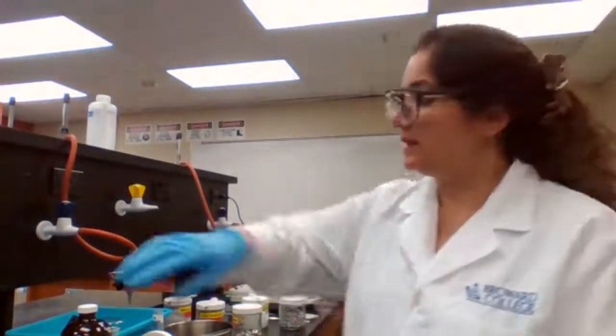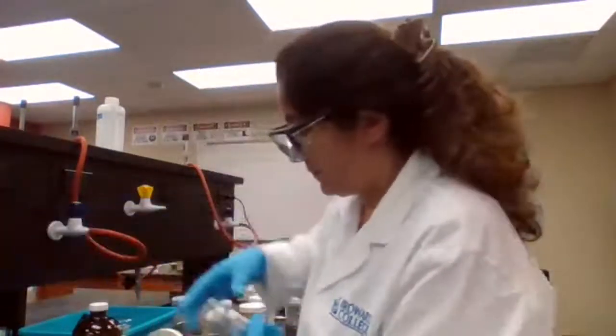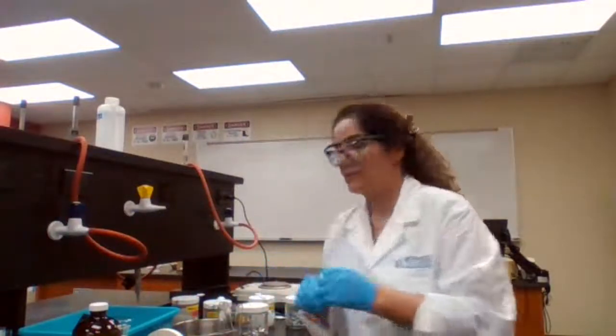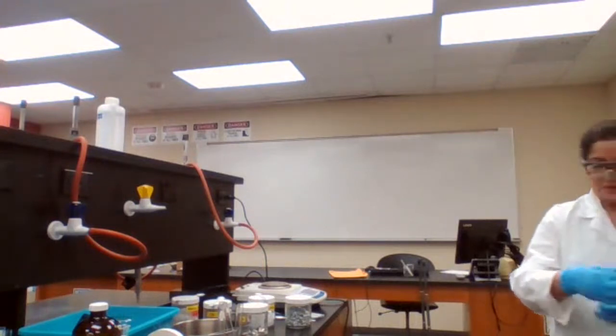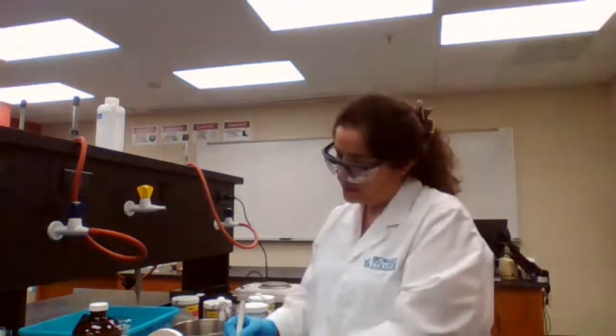3 milliliters of potassium permanganate in 4 test tubes. One part. I need oxalic acid in a different test tube, so I have my test tubes 2.